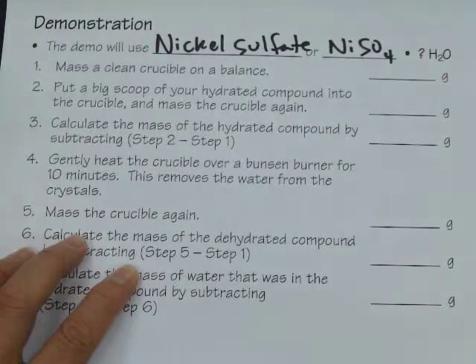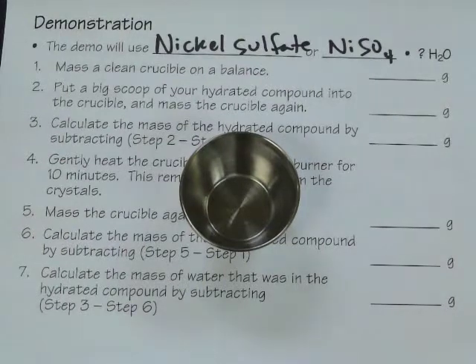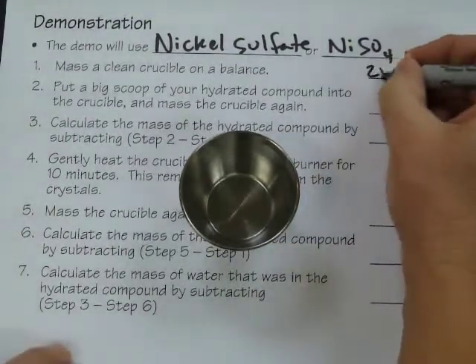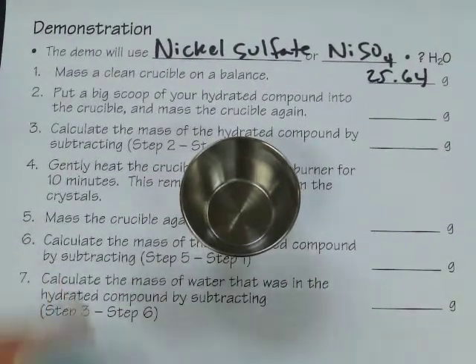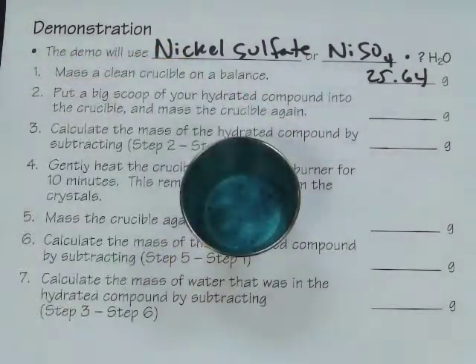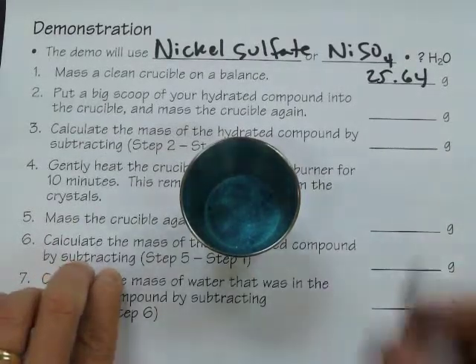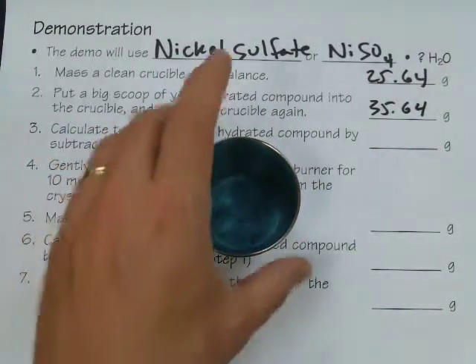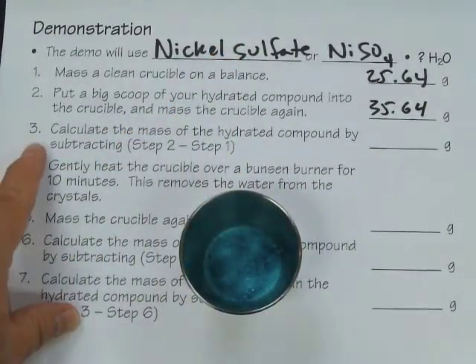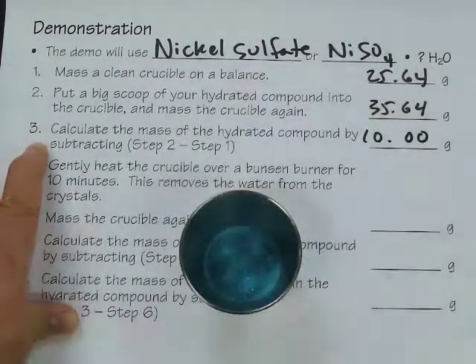So the steps are, first, to take a clean, empty crucible and to weigh it on a balance. And when I weighed this crucible, it was 25.64 grams. And then pouring the substance in, you need about a good scoop or so. This weighs 35.64 grams. And so I purposely use this amount, because then when I calculate the mass of what I just put in there by subtracting, it's exactly 10.00 grams.